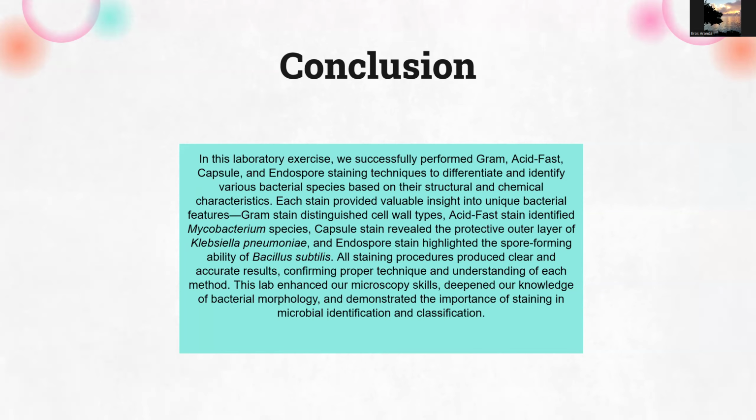Each of these produced clear and accurate results, in which each of them we got what we were looking for. This lab overall enhanced our microscopy skills, deepened our knowledge in bacterial morphology, and demonstrated the importance of staining and microbial identification and classification. Overall, I'd say this lab was a success.